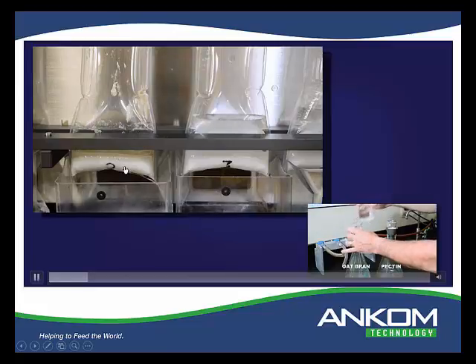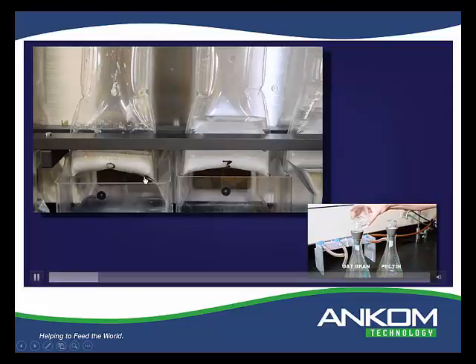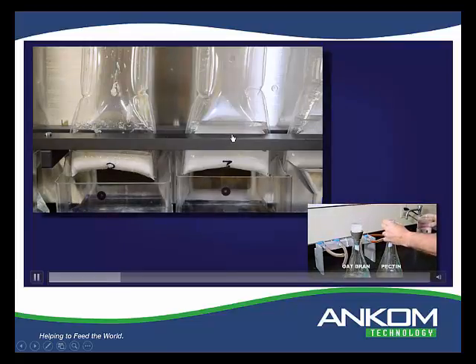Many of our samples, quite frankly, are under a minute. But oat bran and pectin would be ones that normally would take a longer period of time. You can see that there's still some filtering happening here. The pectin, because of the way pectin is, is causing some gel, so it's much slower filtration here. But here on the conventional side, I'm still working on getting the solution in for the oat bran. You can see that this is taking time to filter. Again, in this case, the oat bran will be finished first, but the system won't start its next step until all of those are filtered.